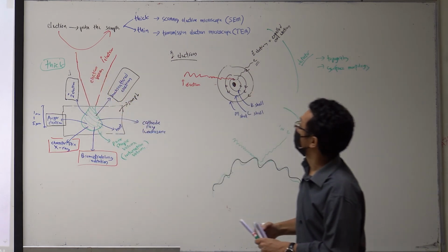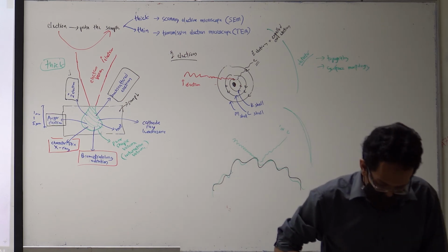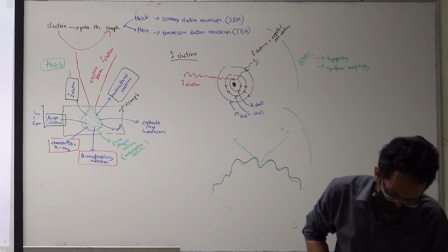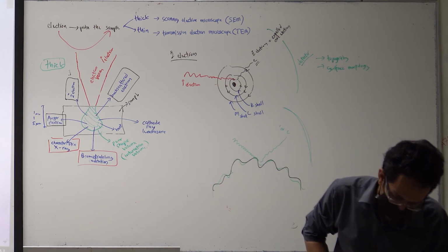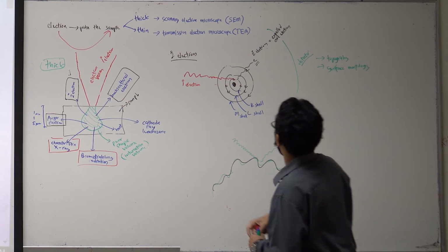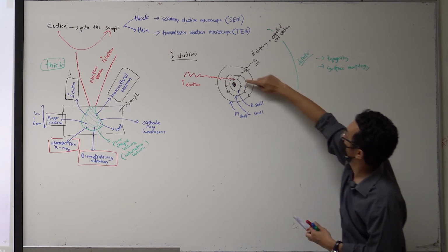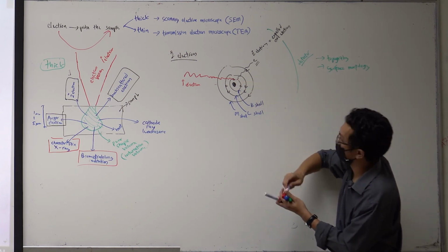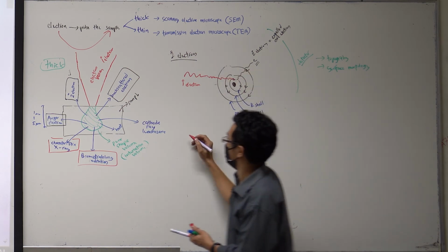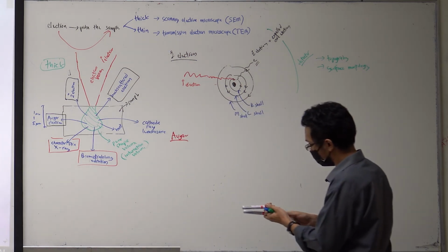We have done the characteristic X-ray and Bremsstrahlung. So now the Auger electron. We know before, when this is empty, so now this is empty. The Auger electron, the same thing.